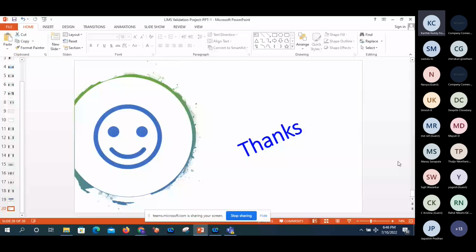Thanks for listening. In this training, are you going to demonstrate all the steps, like preparation of product codes and master preparation? Everything you're going to explain?